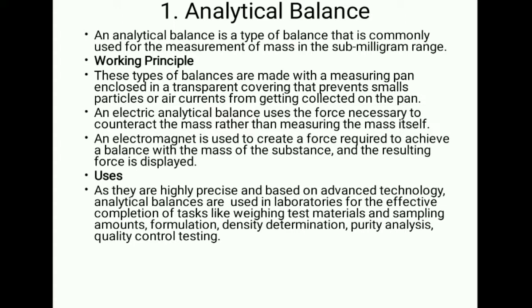Talking about use, as they are highly precise and based on advanced technology, analytical balances are used in laboratory for the effective completion of tasks like weighing test material and sampling amount, formulation, density determination, purity analysis, quality control testing.